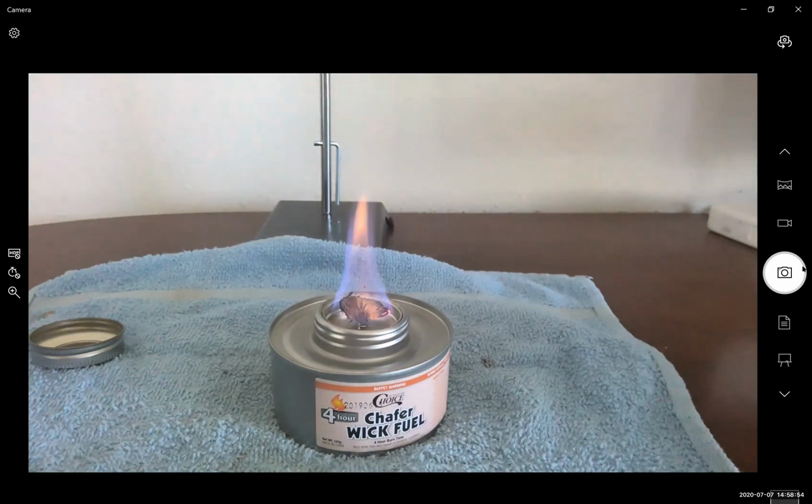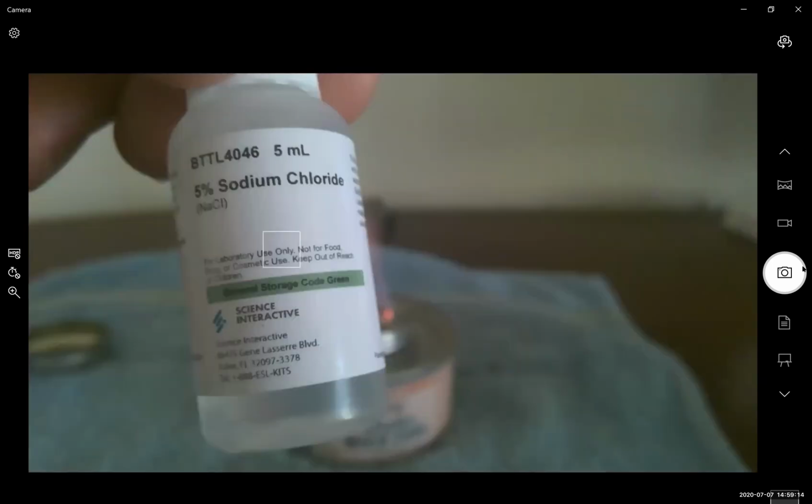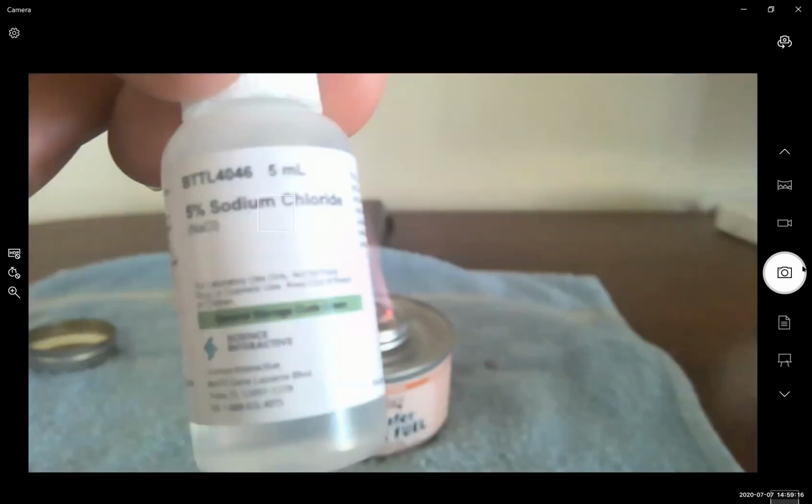We'll return back to calcium. Let's try a few of the more distinct ones. Potassium's hard. Let's look at sodium. So we're looking at sodium chloride.